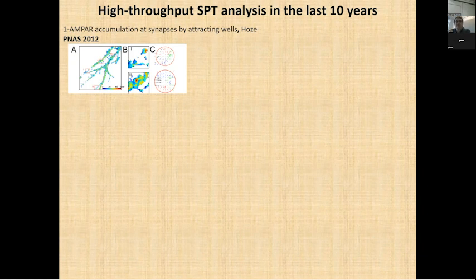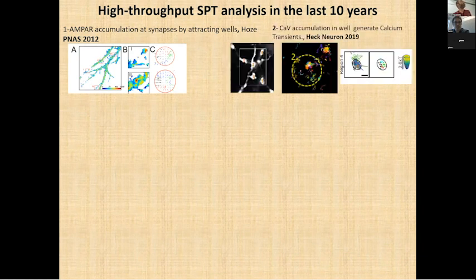So you see this spot here, it corresponds to a high density region, and associated to this, you have this potential well, this structure I will describe. So you can do this for calcium voltage channels, and you see associated to calcium transients, where you have high calcium, you can see that this area corresponds to a region where you have accumulation of receptors, and they're associated to a structure that maintains them, which is a potential well.